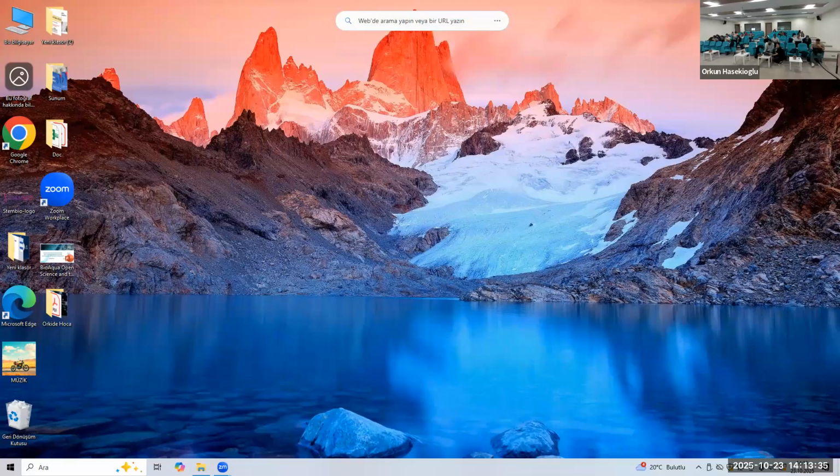You go to File, New Molecule, Browse, and I'm in the right folder.